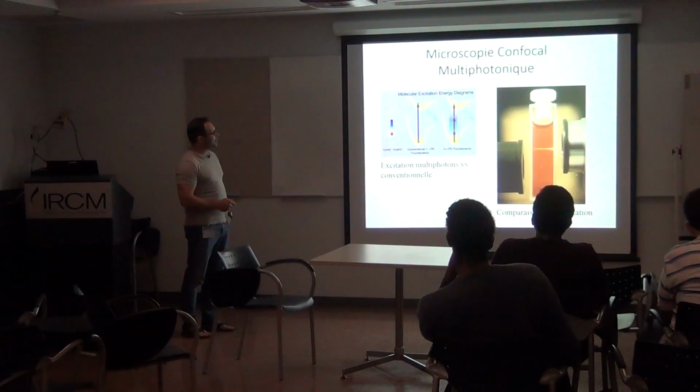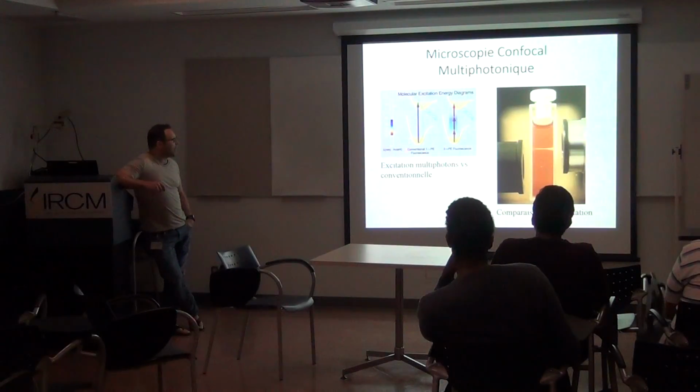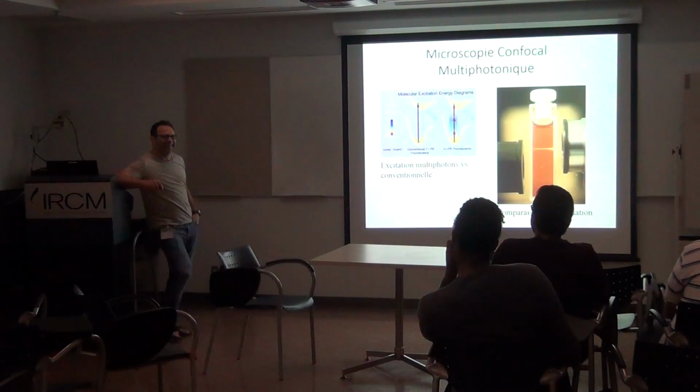Confocal microscopy and what is called multi-photon microscopy. This is a really nice technique, where you use the fact that if you throw a bunch of photons, and when I say a bunch of photons it is many, I don't know the numbers, how do you call it when it's big like that? 10 with maybe 15, 20 zeros, photons, okay, so a couple.